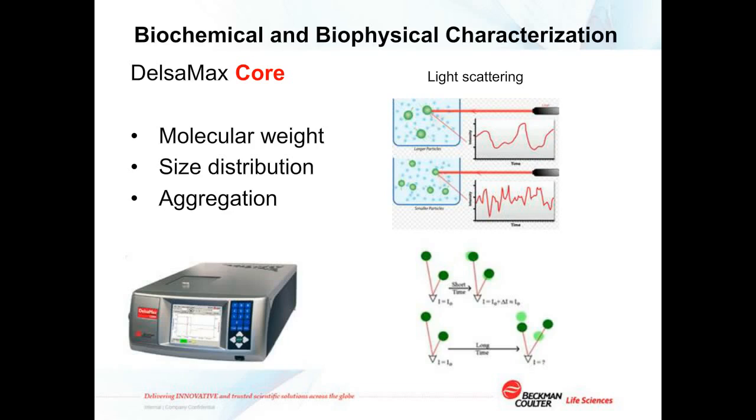And with light scattering, the correlation of scatter in time will provide an indication of the sizes of the proteins in solution. So I show at the top right an example of a large protein, or it could be other types of molecules. But the idea is, when light is scattering in time, it is quite correlated if the protein is larger, because it's moving relatively slowly. If the protein is smaller, it will actually be moving much quicker by Brownian motion, and the change in scattering patterns in time will change much quicker.